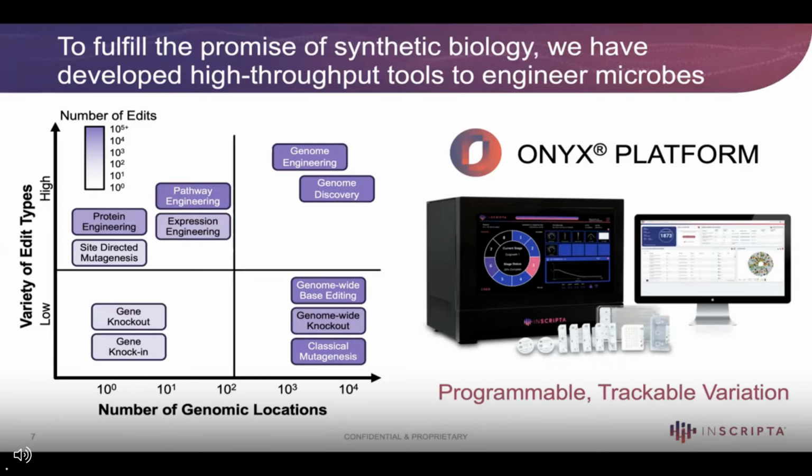And you have the capacity to do protein engineering. Think of massive site-directed mutagenesis capacities with barcode trackability. What that barcode trackability means is that every variant you've generated is now accessible through that barcode, which is not accessible with protein engineering on plasmids. And then as you think more broadly, there's all the great stuff that we know about pathways, and then there's all the stuff that we don't know about genomes.